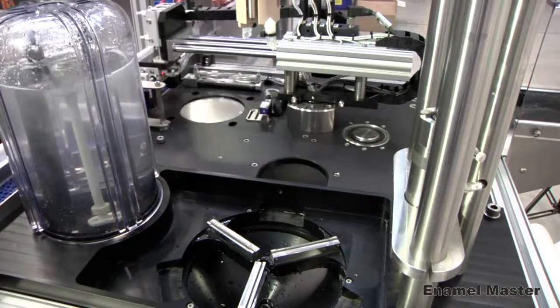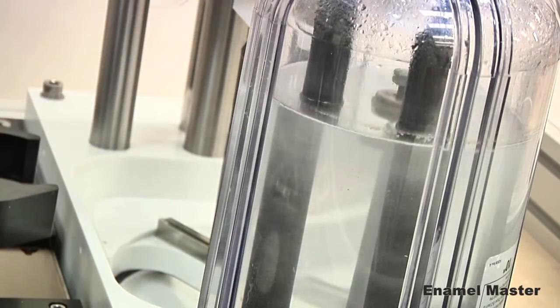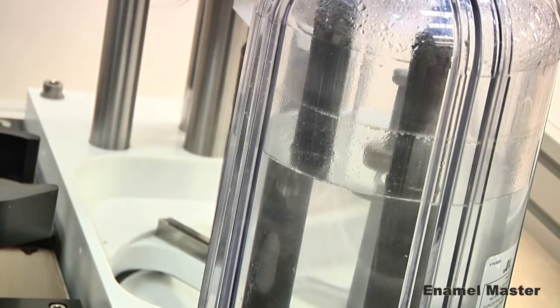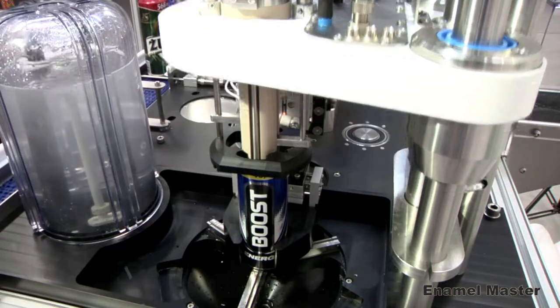Electrolyte quality and level is checked during each test, along with can contact and test voltage. This helps ensure that each test is carried out to the same consistent parameters.